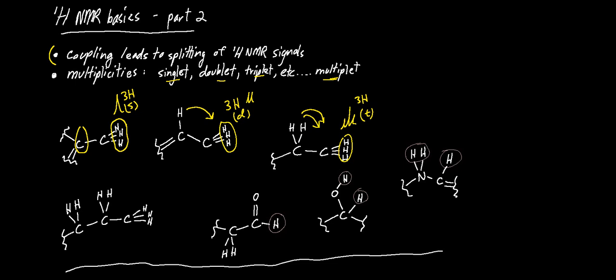If we have an extended system like you see here, this still is the same. Three hydrogens split two more times into a triplet, but these two protons here are equivalent to each other. They generate a two-hydrogen signal, split 5 additional times, resulting in 6 lines total, or a sextet.